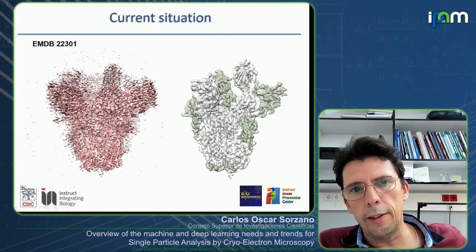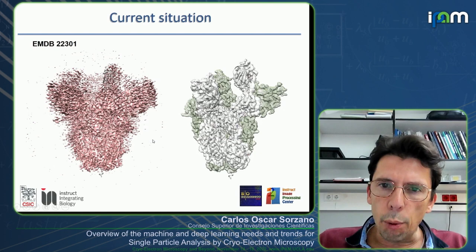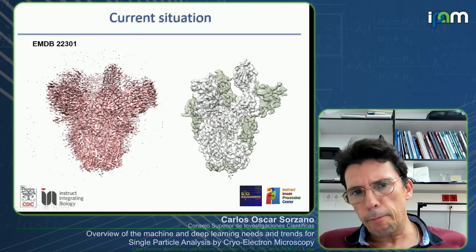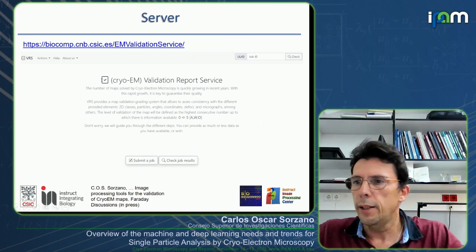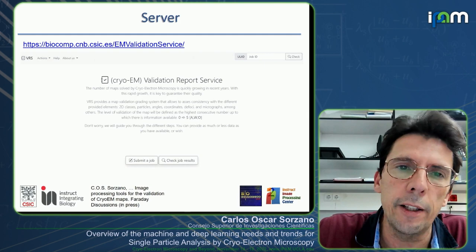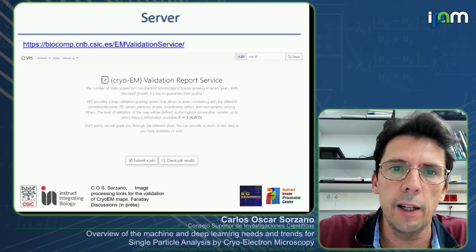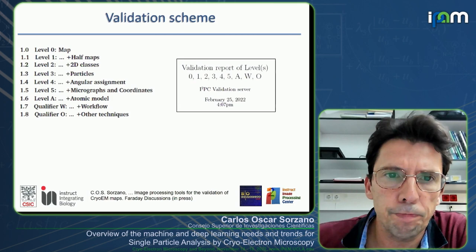This is our current situation. At the EMDB, there are structures with visible artifacts. When you reprocess the same data applying all the checks we discussed, the result is noticeably different. To address this, we have set up a validation server that incorporates all the methods we know for validating structures. You can submit your structure, the two half-maps, particles, classes, angles — whatever you have — and check whether there is any pathology in your structure.